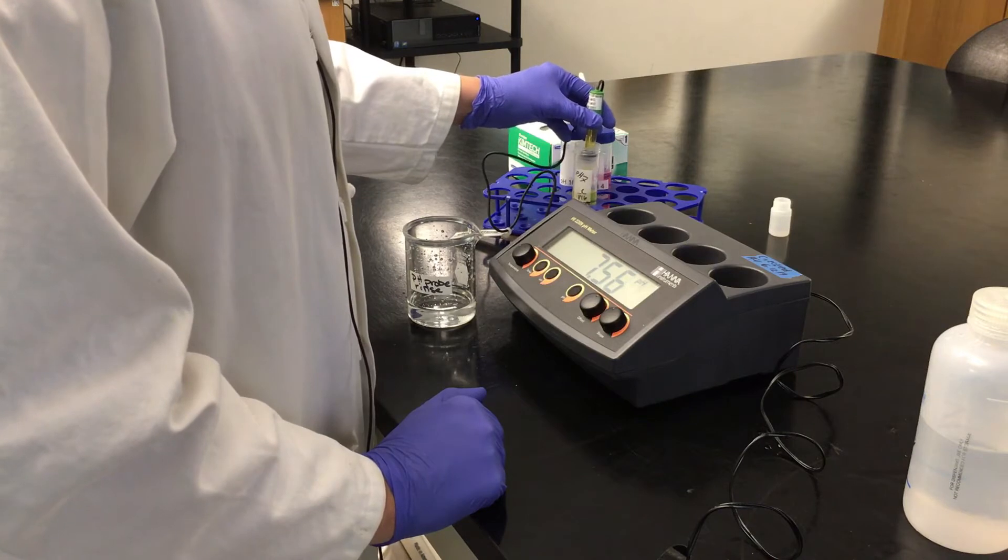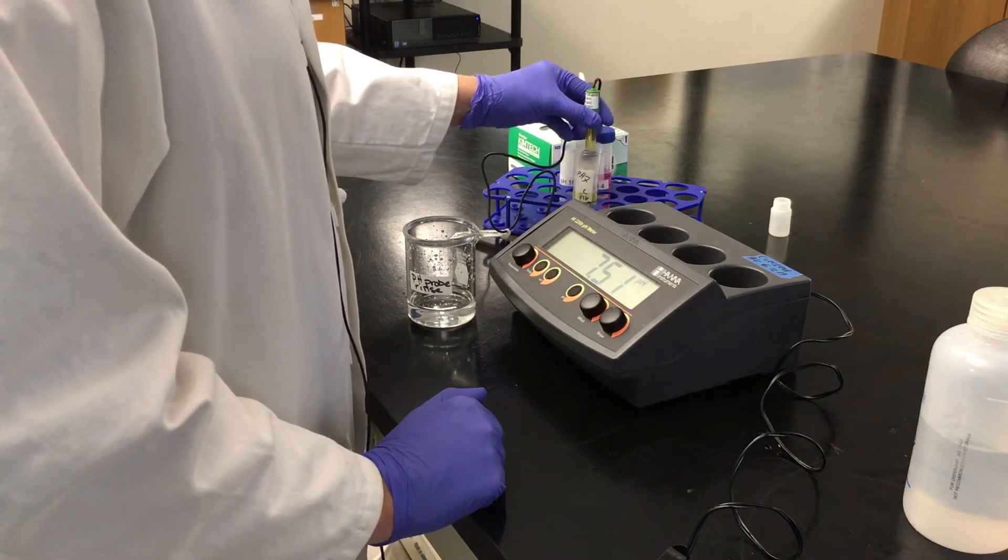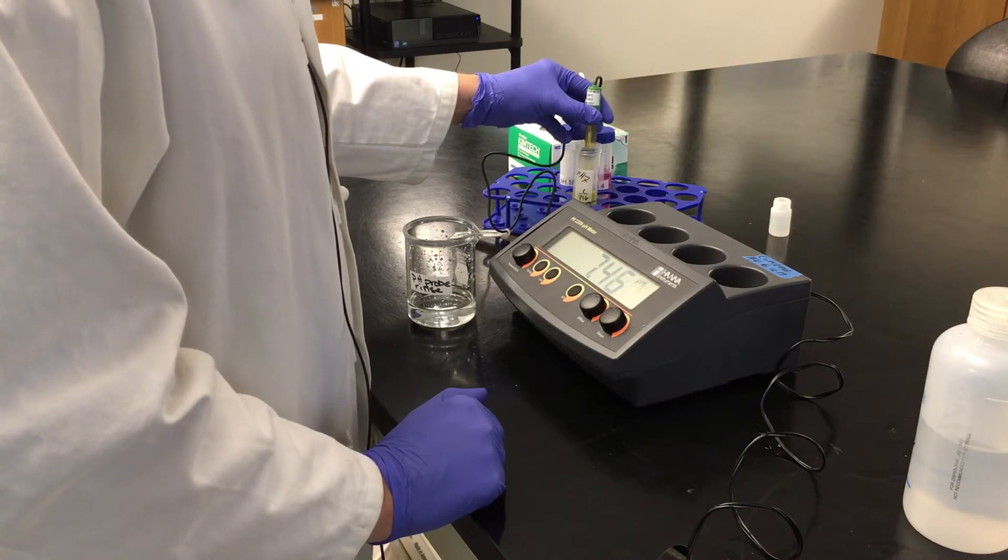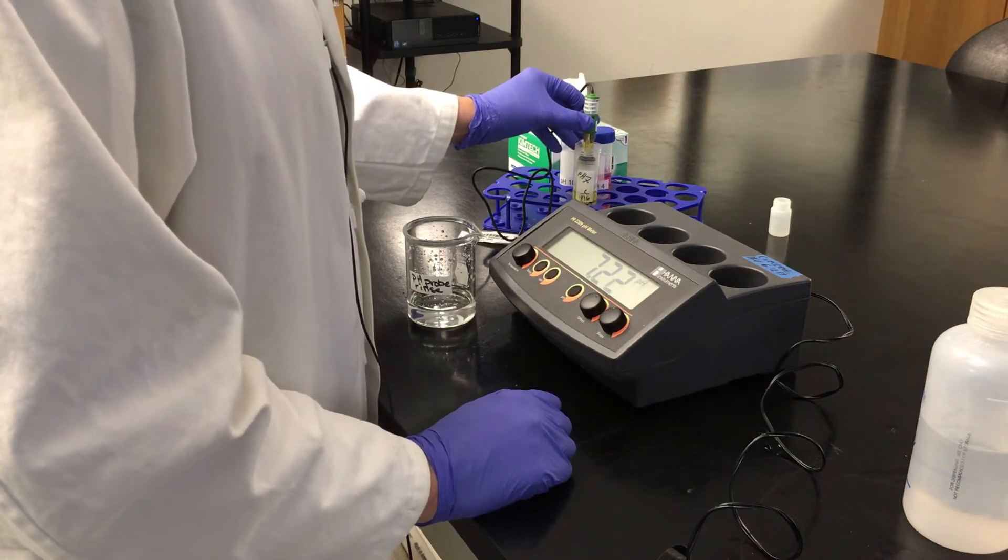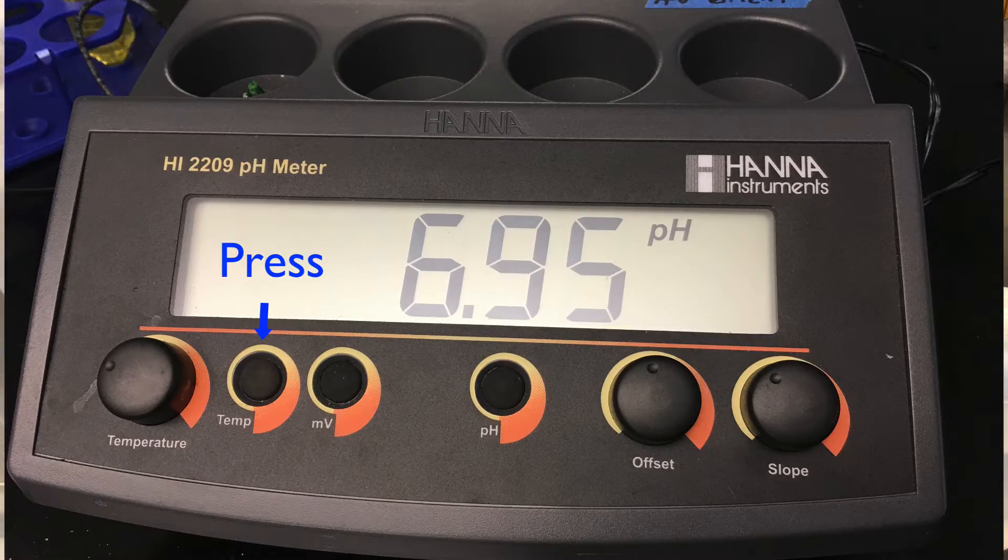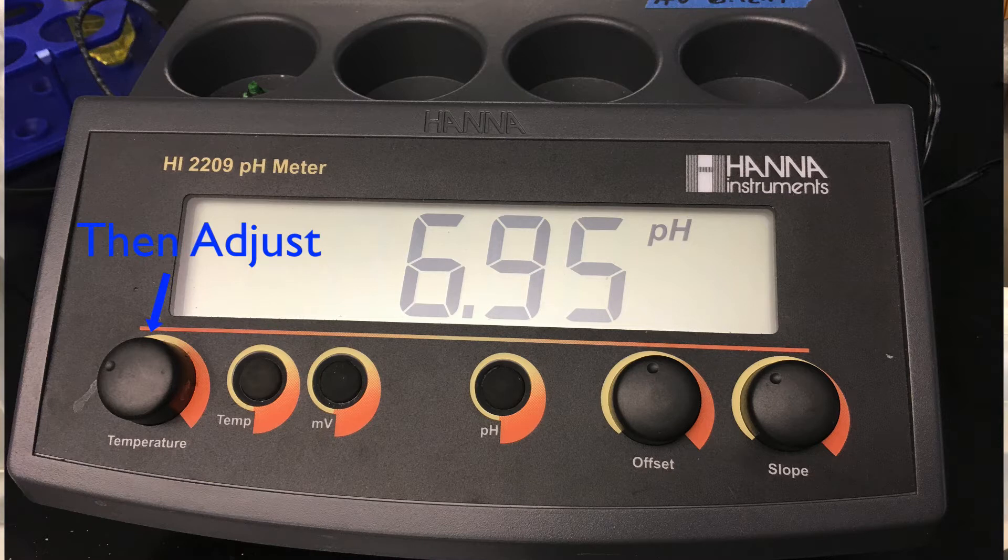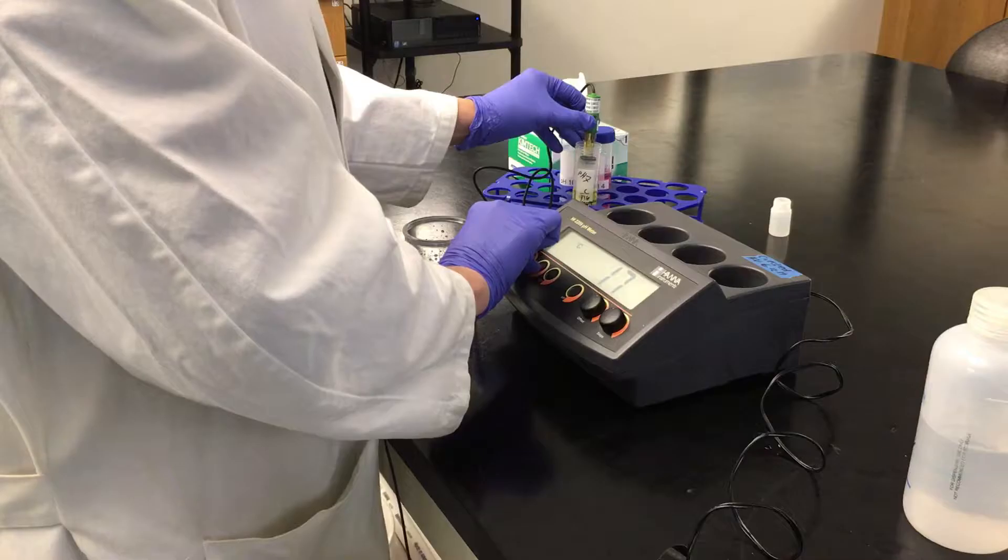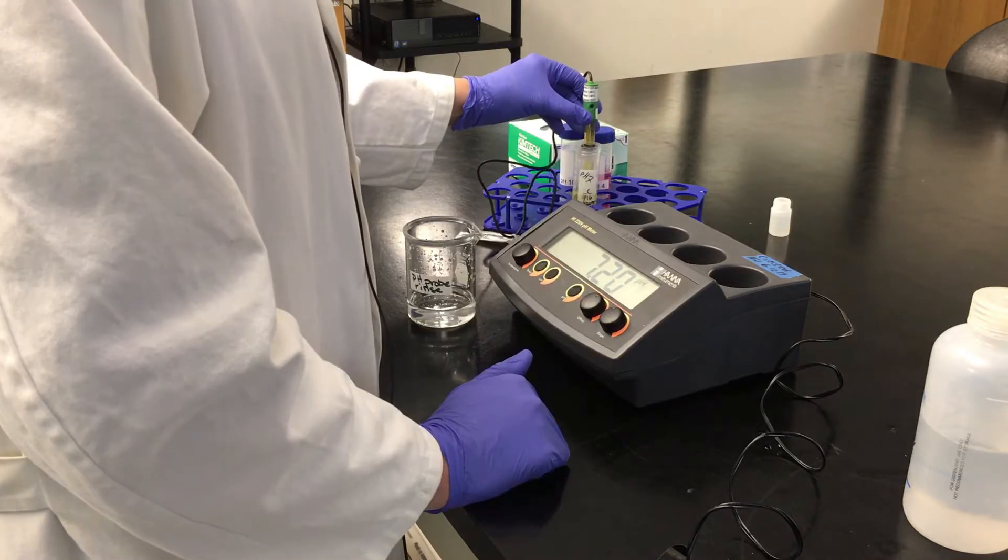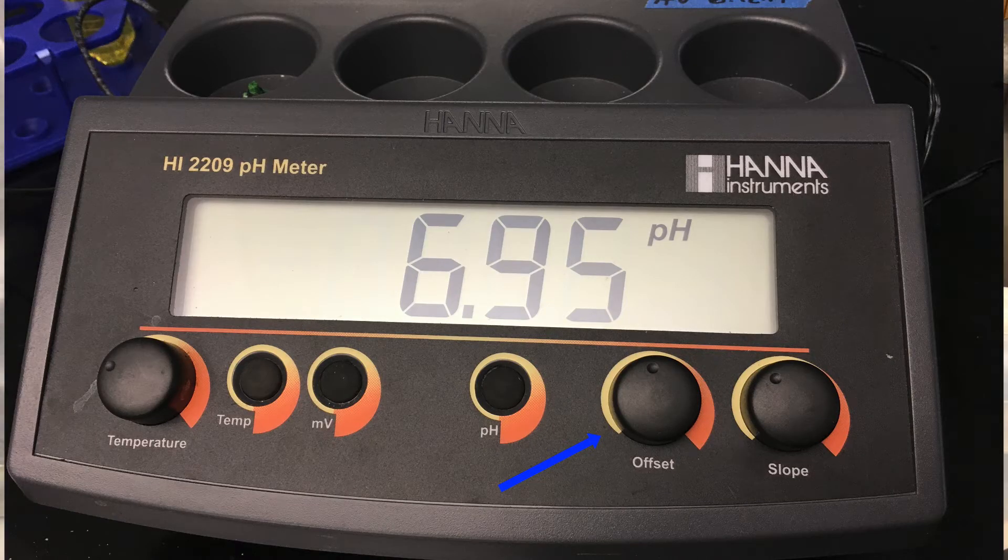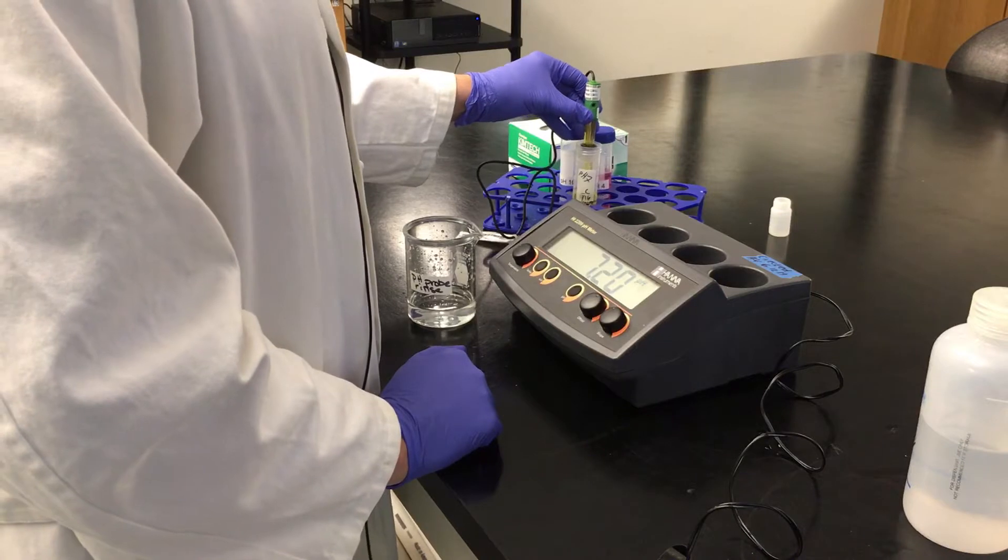At this point, we're waiting for the reading to stabilize. Now that it's stabilized, I'm going to press and hold the temp key, and then move the temperature knob until I get to the appropriate temperature, the reading on our thermometer. Okay, at this point, we're going to adjust using our offset knob to adjust the pH so it reads that it's pH 7.